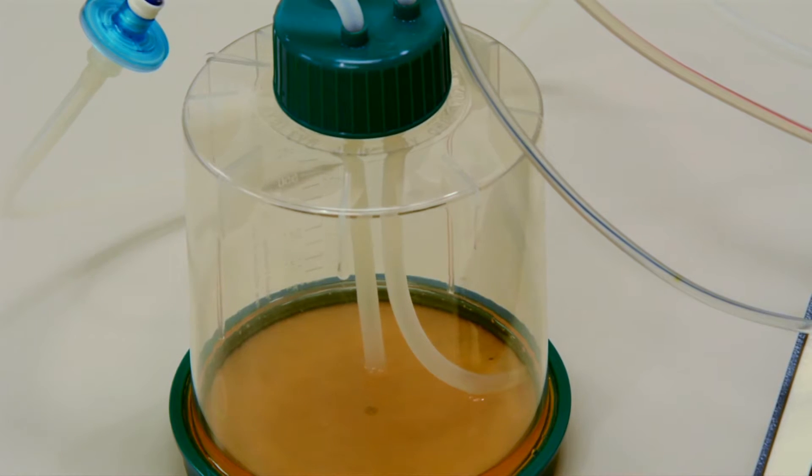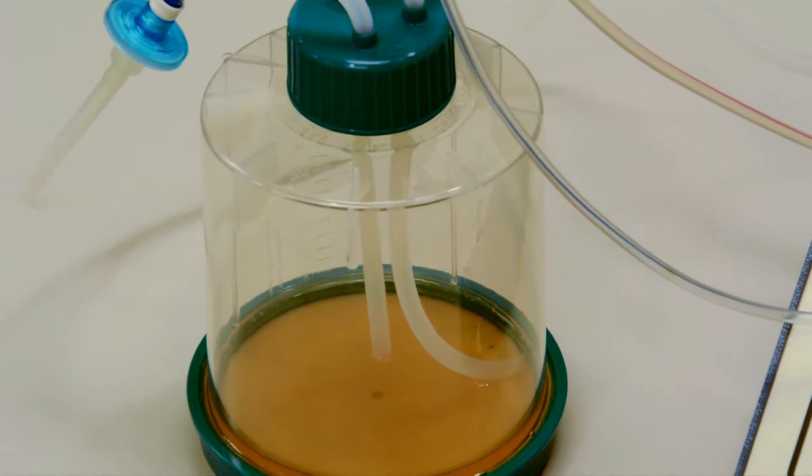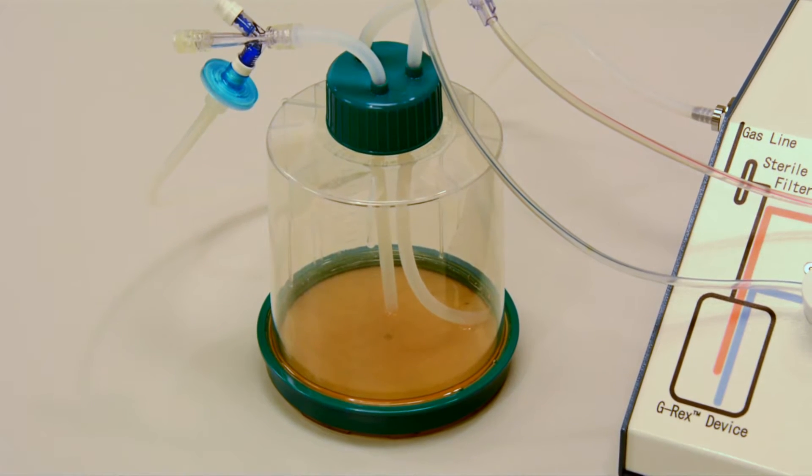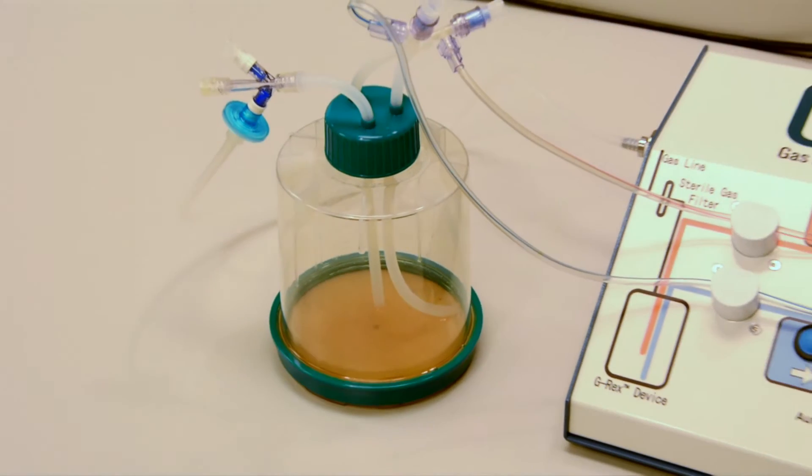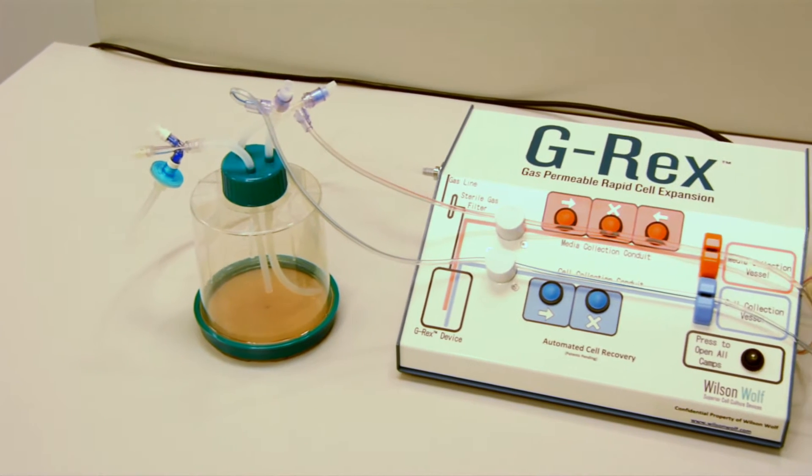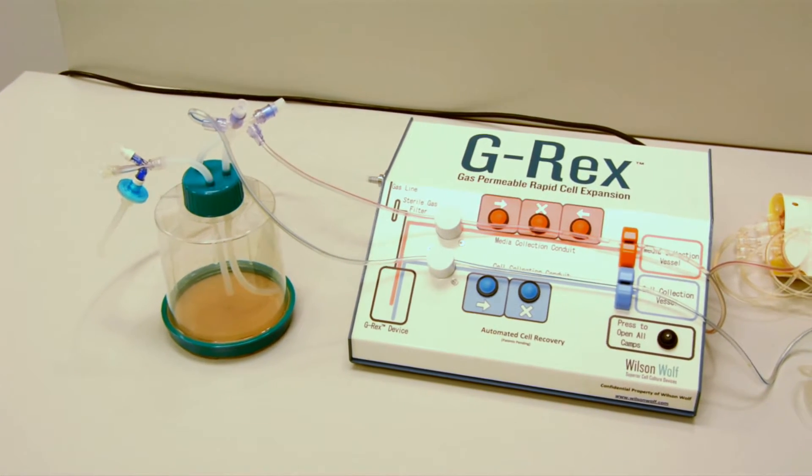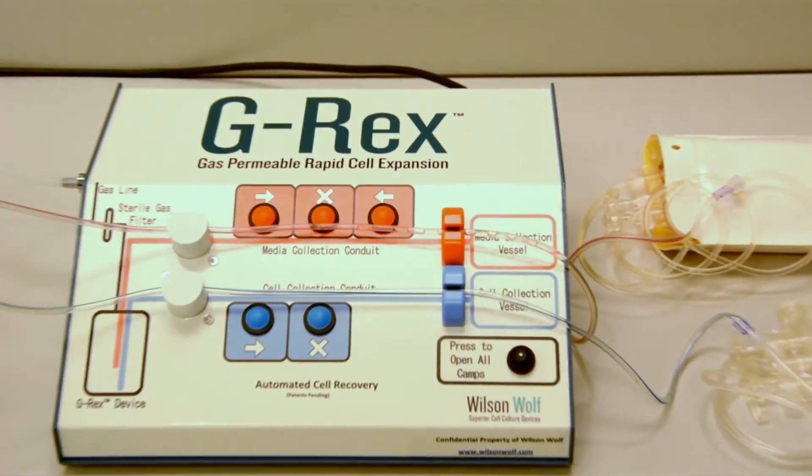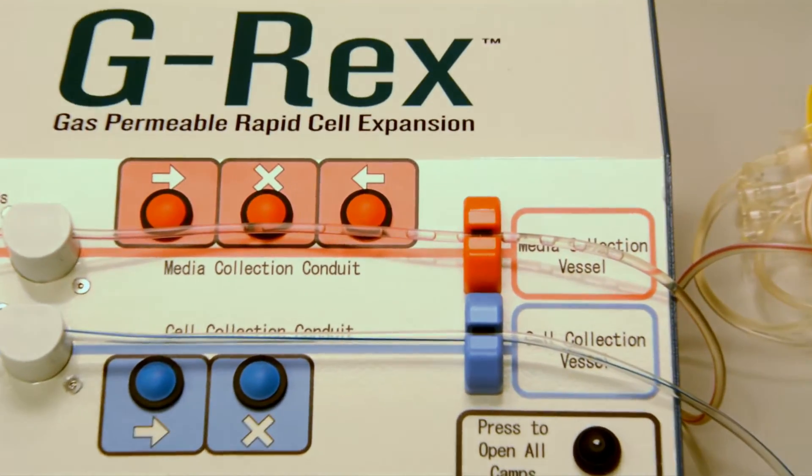This is the G-REX with nearly 90% of media drained out. When the liquid level drops below the media collection line, air is drawn into the tubing, forming bubbles that are sensed by the optical detector, stopping the process automatically.